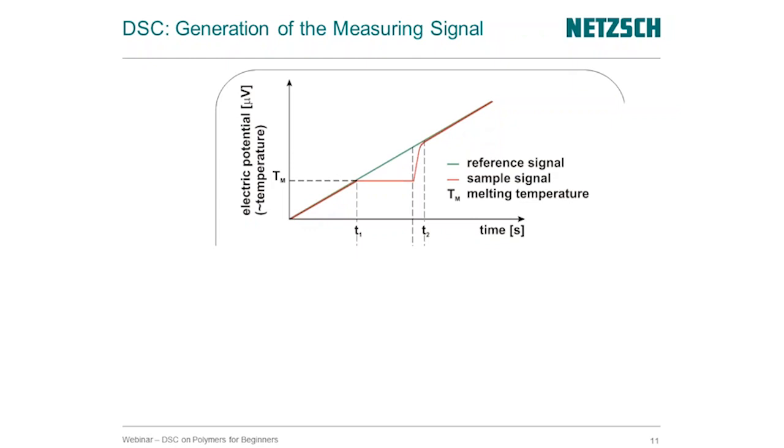If we compare that then to the crucible on the opposite side that has a material in it, you can see that there's an effect going on when we get to this critical point. So energy is now going into the sample, until it finally reaches an equilibrium state and then begins to catch up. So what we're really looking at here in this example is a melting behavior of the material.